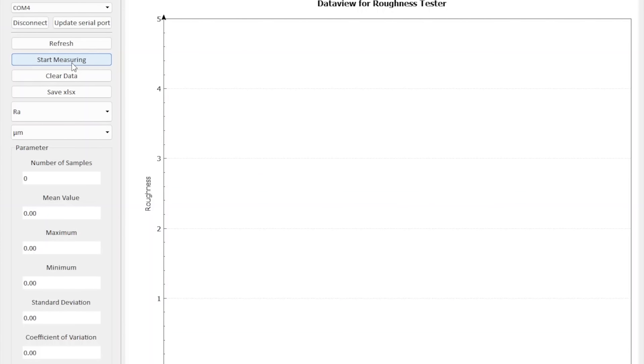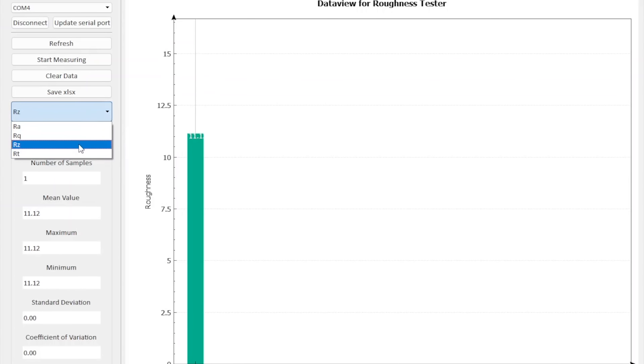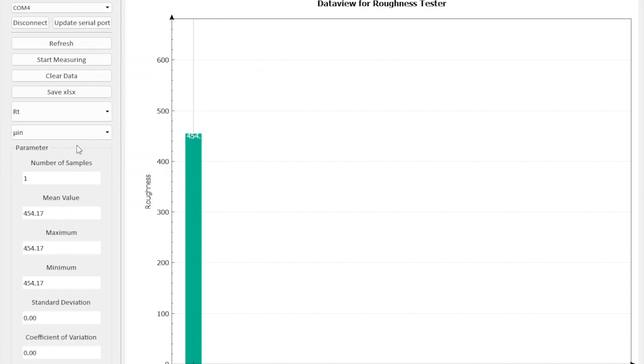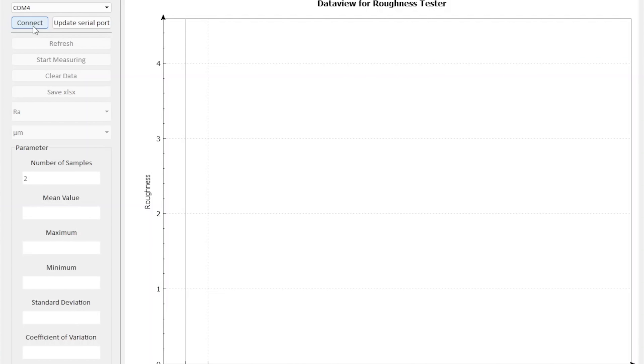Clicking start measuring will begin a test cycle. Once the test is complete, click refresh and the data point will be shown on screen. The toggles down below will allow you to switch between the different parameters, while the toggle below that will let you switch between units. The box underneath that drop-down will display a variety of statistics about said measurement. After taking multiple measurements, the values will automatically update. When you are done, disconnect from the device, power the unit off, and you can close the software.